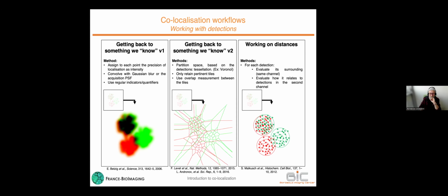Yes, please. I had a question. There are a lot of websites where you can check subcellular co-localization of proteins. I was just wondering, how are they made? Based on what? Image analysis or RNA-seq data? Usually you type in two proteins, and then they show the Pearson's coefficient. So I was just wondering.